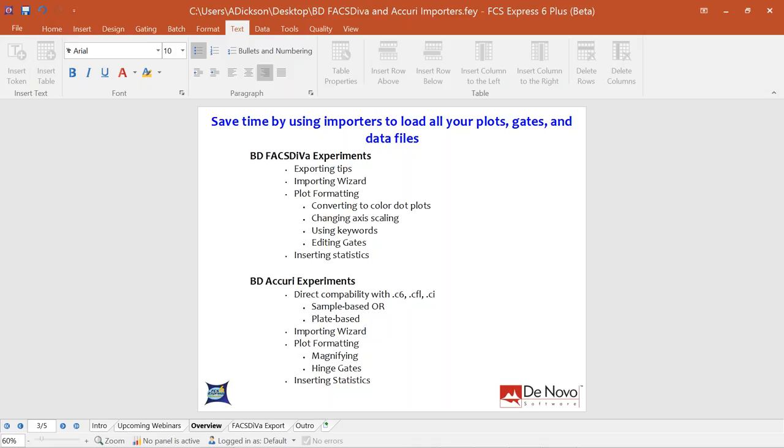We'll do a similar workflow for the BD Accurie importer, which is also quick and simple. Because we have direct compatibility, you don't have to export Accurie files as FCS — you can use the C6 or CI file types, either with a sample-based or plate-based configuration.